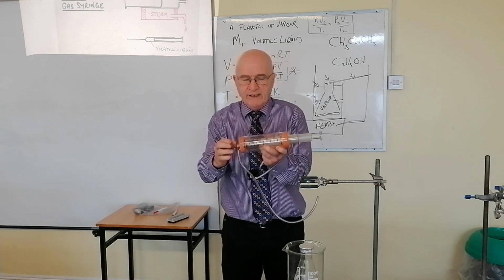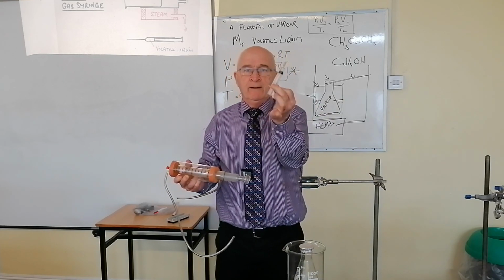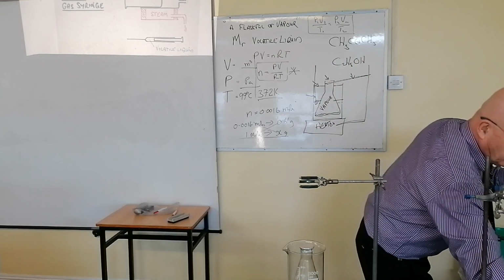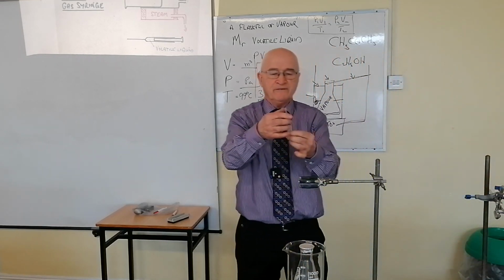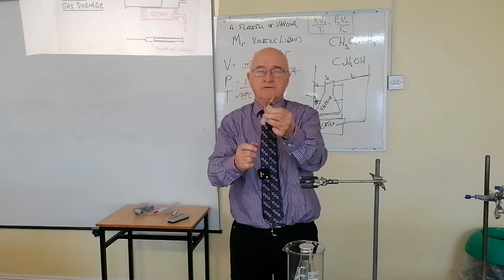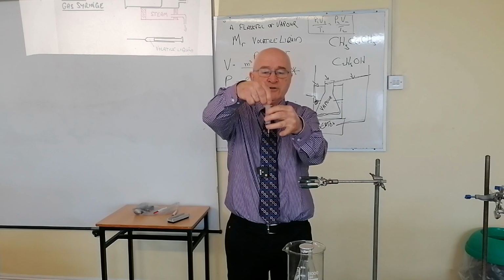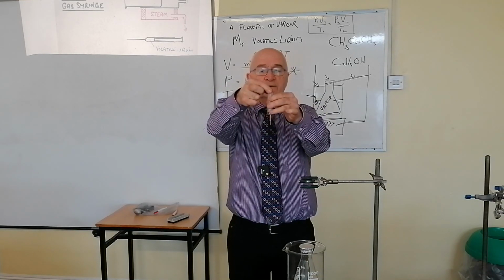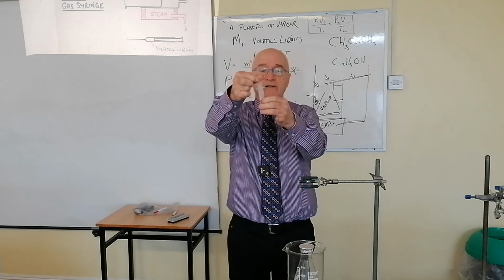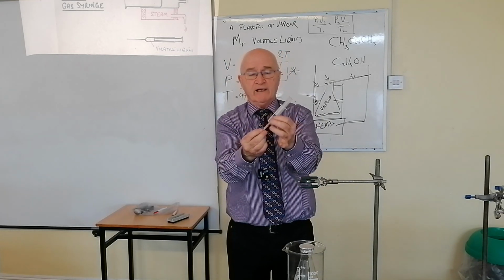And now what you do then is, you get the volatile liquid and you put it into this. That's a hypodermic needle. Okay, now please let me put this down a moment and show you what you actually do. The thought is probably striking you now that I know why we don't use this in class. This will be very dangerous in class now. You need to be careful because obviously you have a needle here. You'd basically get rid of the air first. You'd suction in some of the propanone, the volatile liquid, in here. Are you okay with that? That's exactly what you do. And you put a safety cap back on it again.